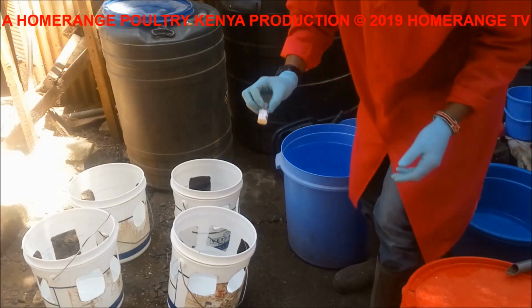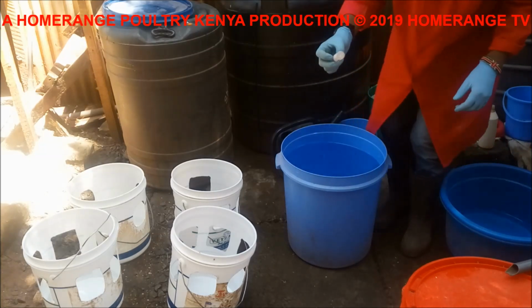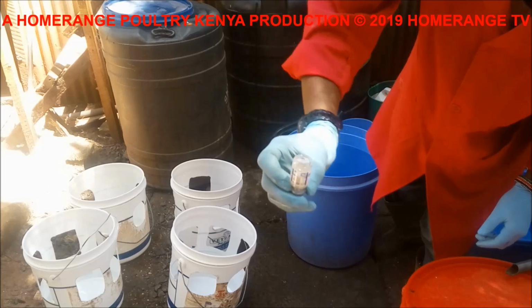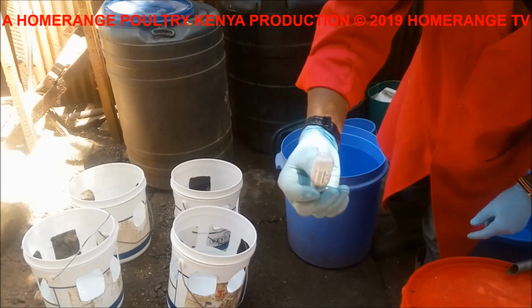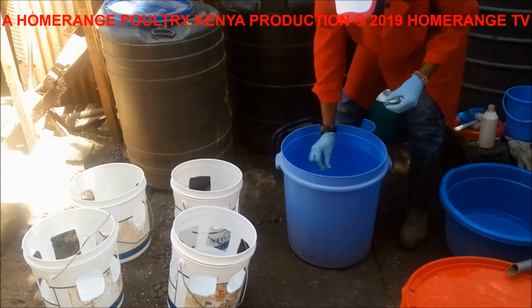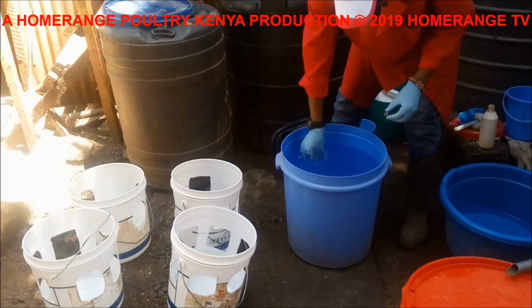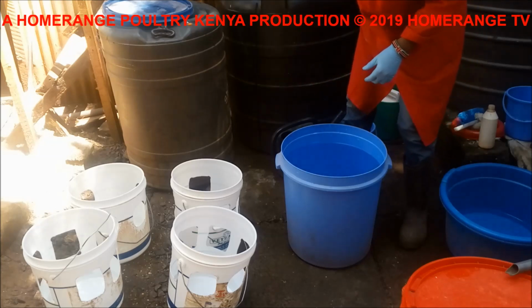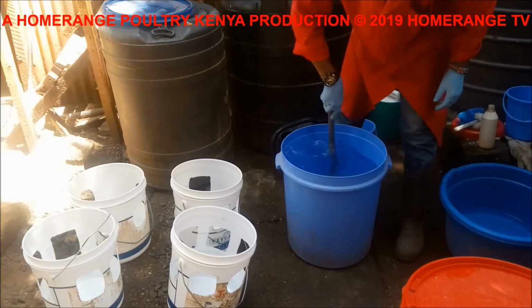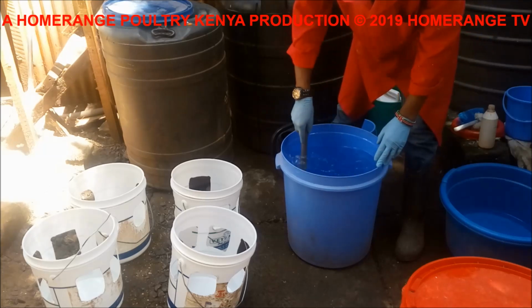The next thing you do is top up the bottle to the very maximum with the distilled water. Mix it up again a bit, just for good measure. Once you do that, as you can see, the vaccine is fully diluted inside. You can't see the solids that were at the bottom. That tells you that the vaccine is well mixed. And finally, you pour the entire vaccine into the distilled water. Just for good measure, I make sure I remove all the vaccine. Then I get a nice clean stick to mix up the water. Again, I'm not using a lot of force, just some mild stirring, and this should help you mix up the vaccine pretty well.